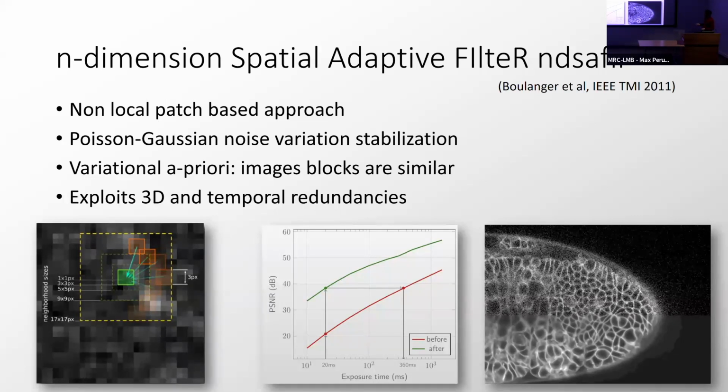Then after denoising, you will jump to this point on the curve, which you could map to the original quality metric of the image, and get a virtually corresponding exposure time.